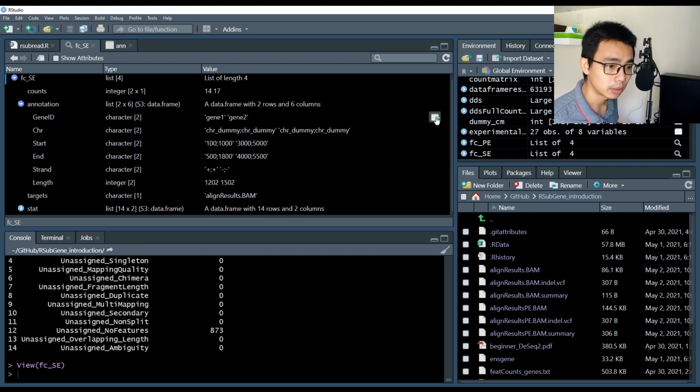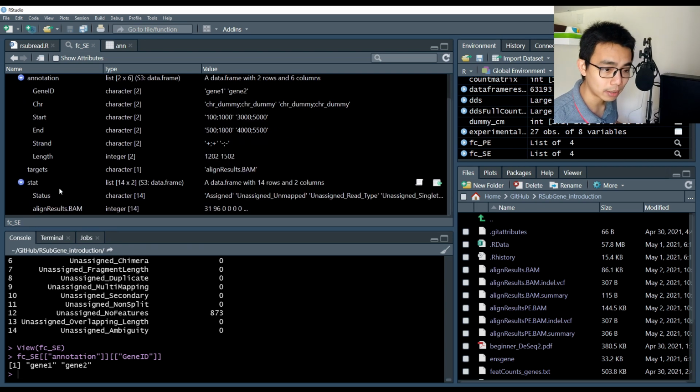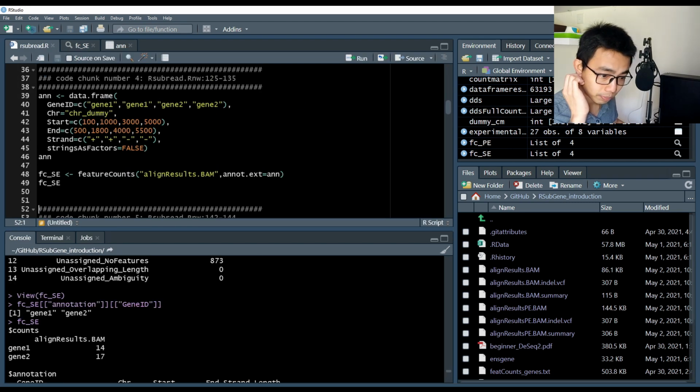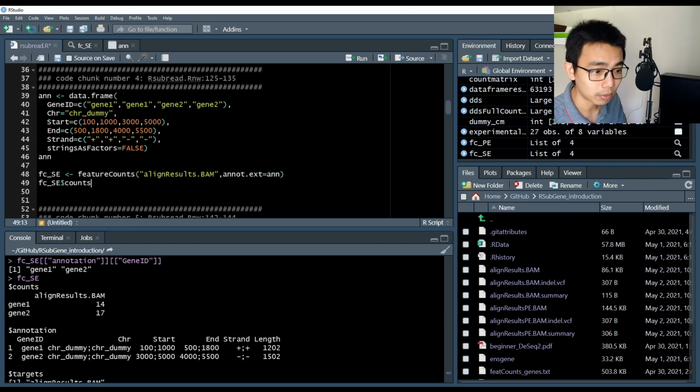Where are you? Yeah, this one. This is the gene number, this is the length, this is the statistic. Okay, it's not here. Oh yeah, it's here. Okay, so it's the count. So you actually need to go for the SE count, something like that.